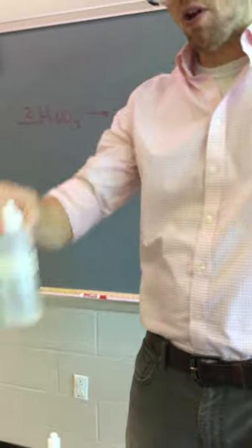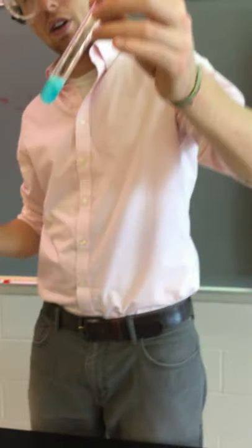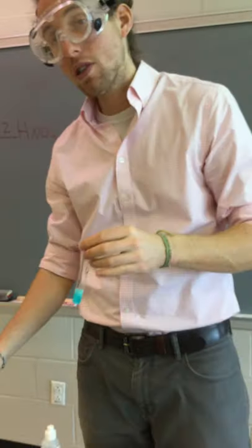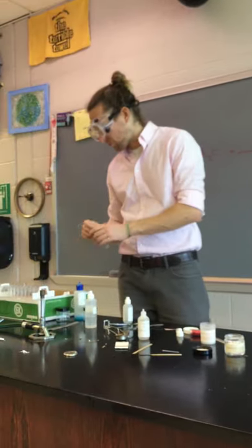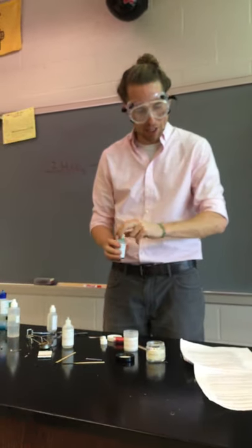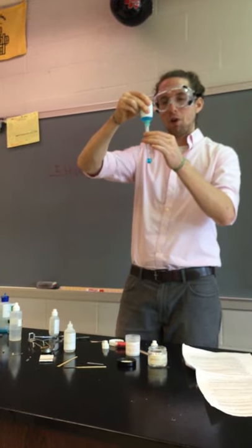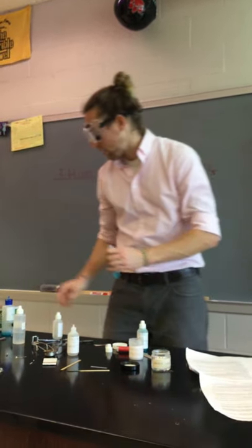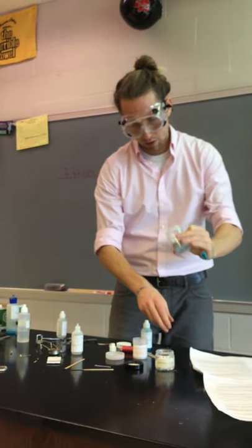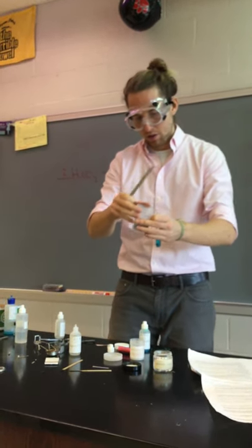So we had two clear solutions. It's hard to tell, but you have sodium phosphate, which is a clear solution. You have copper chloride, which is a blue colored solution. Those came together to form liquid and solutions surrounding a white solid. It looks really cloudy. Moving on to reaction number six. We're again going to use our copper chloride. This time we are going to add zinc. And I apologize, I actually got these ones backwards. So the reaction you just saw with white precipitate is reaction six. My apologies. This is reaction five. So reaction five uses copper chloride again. They both use copper chloride. But reaction five is going to be copper chloride reacting with zinc.